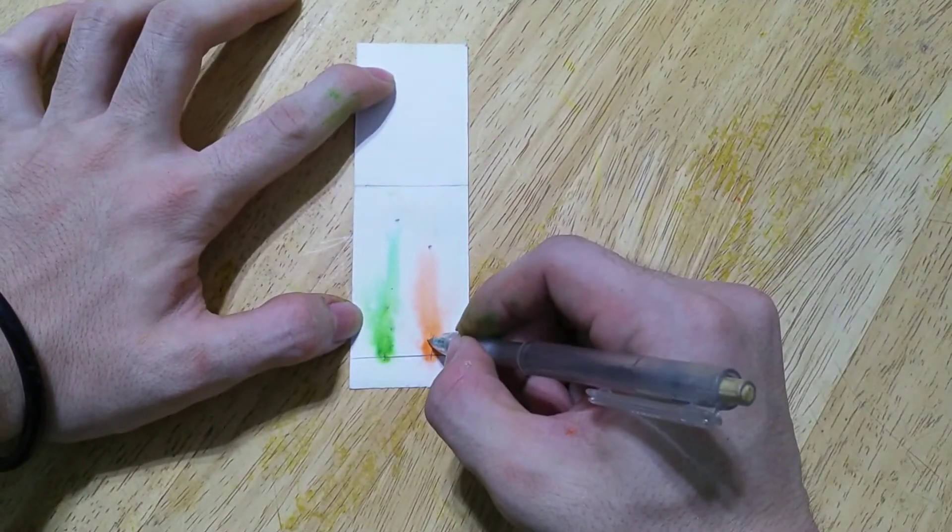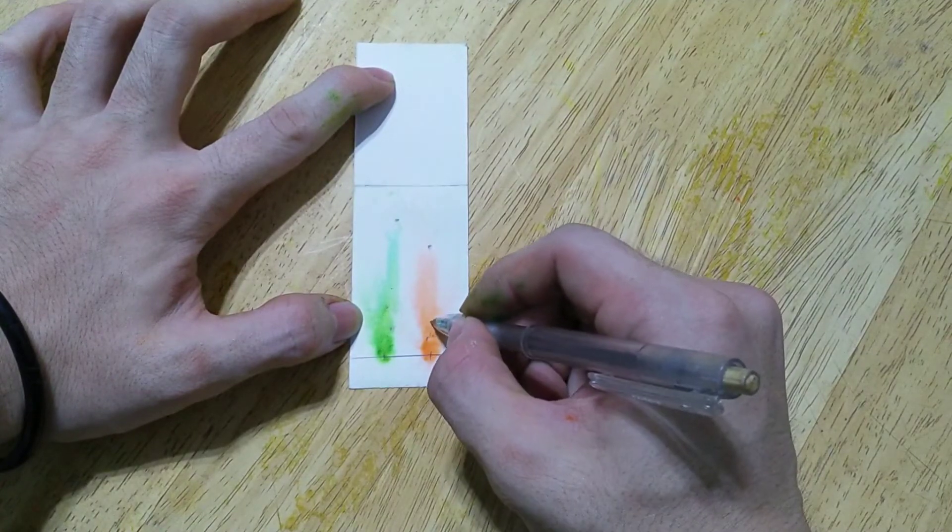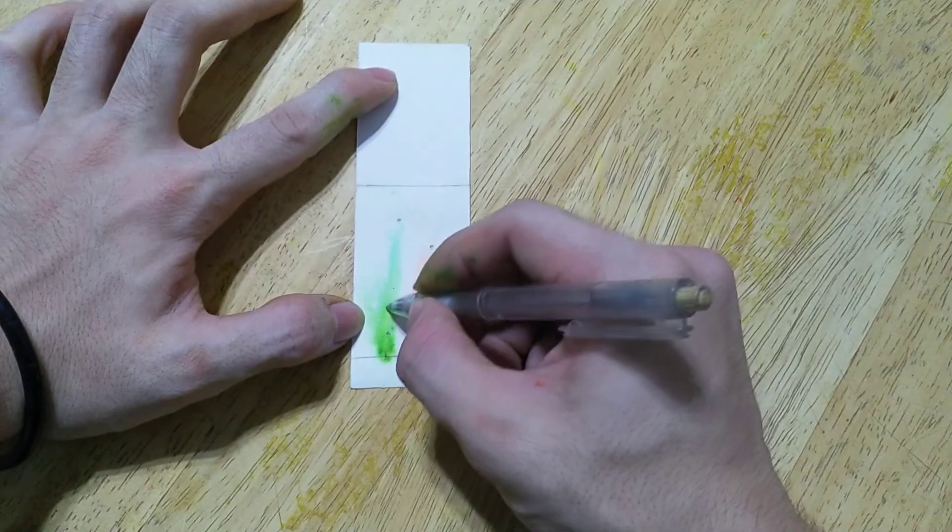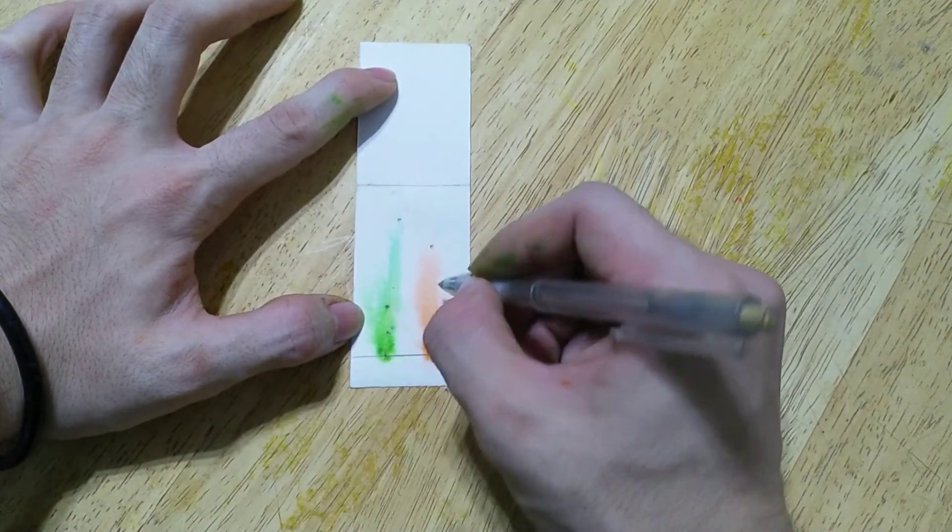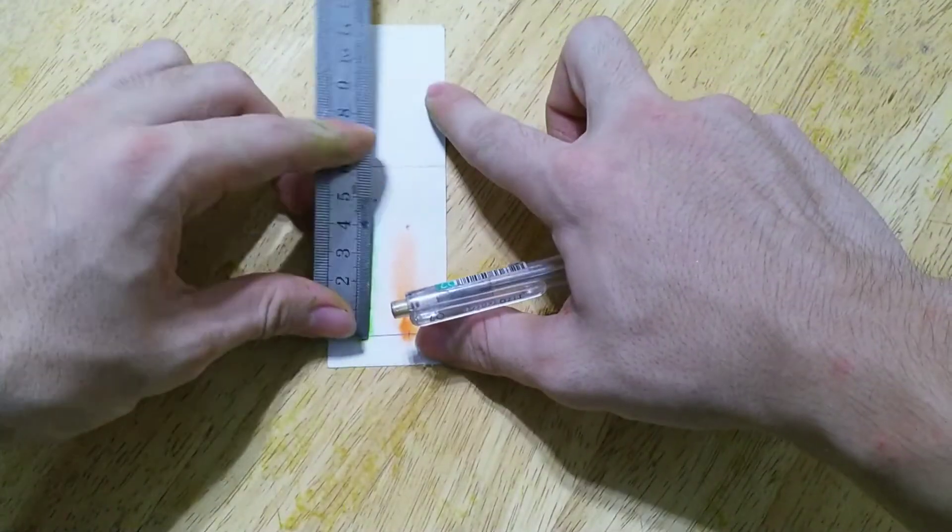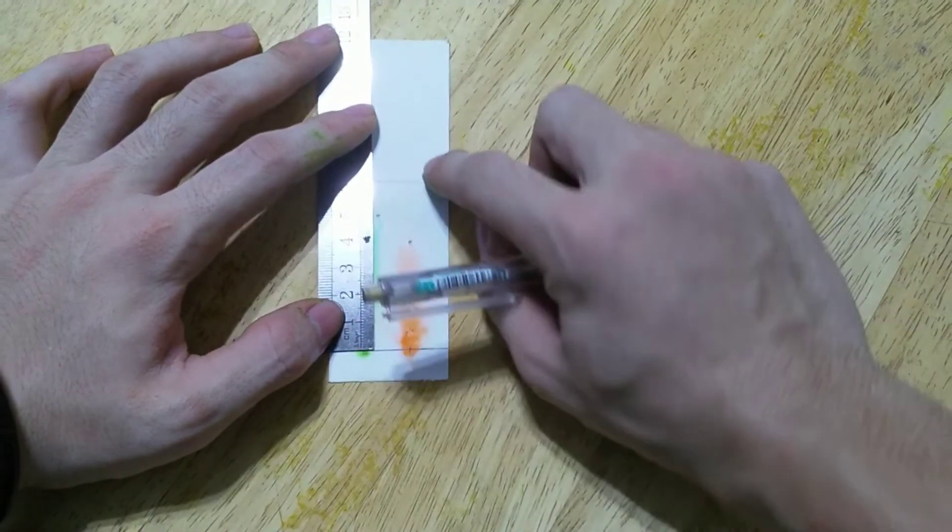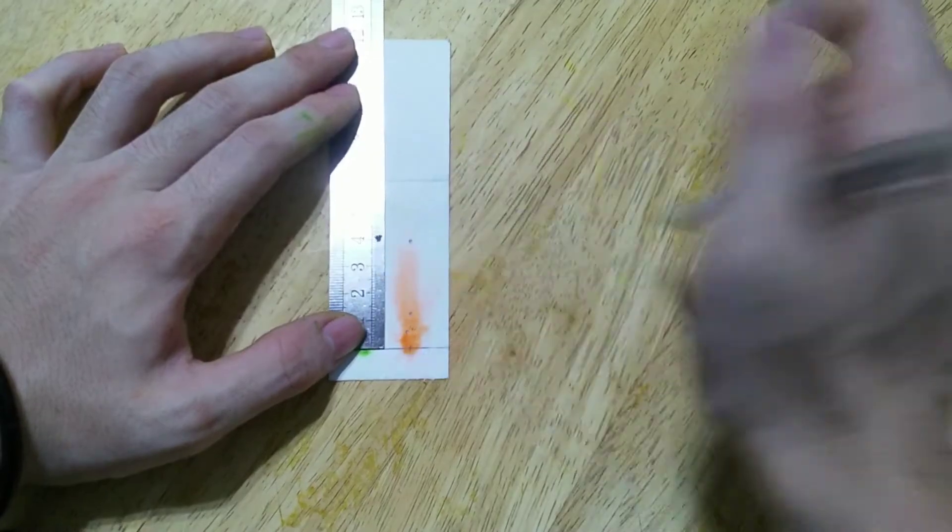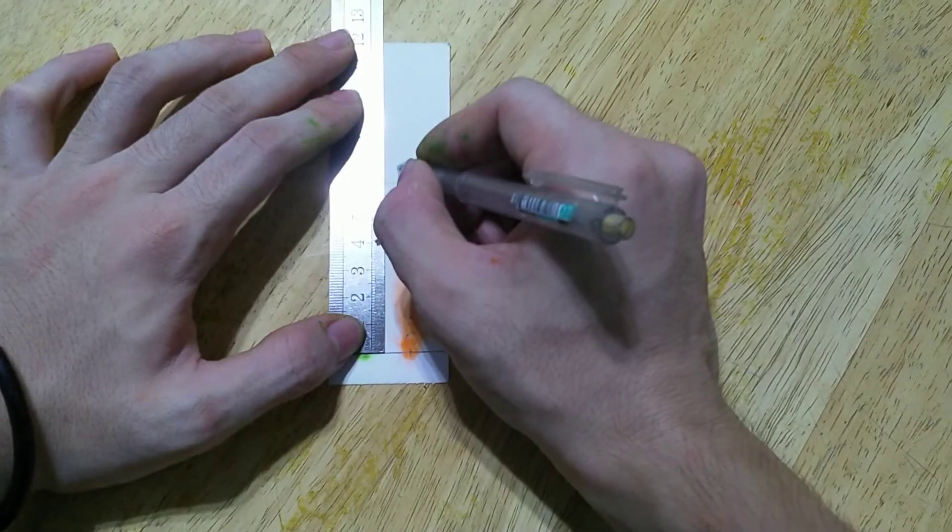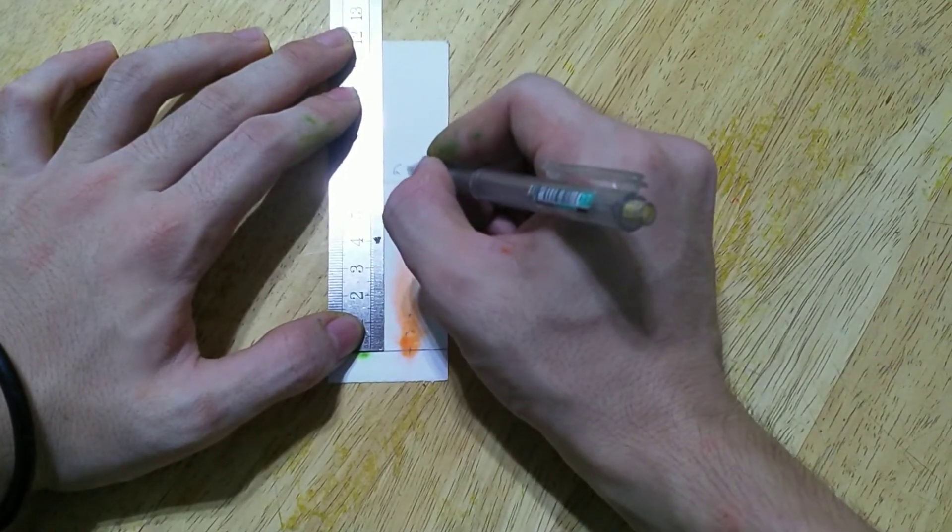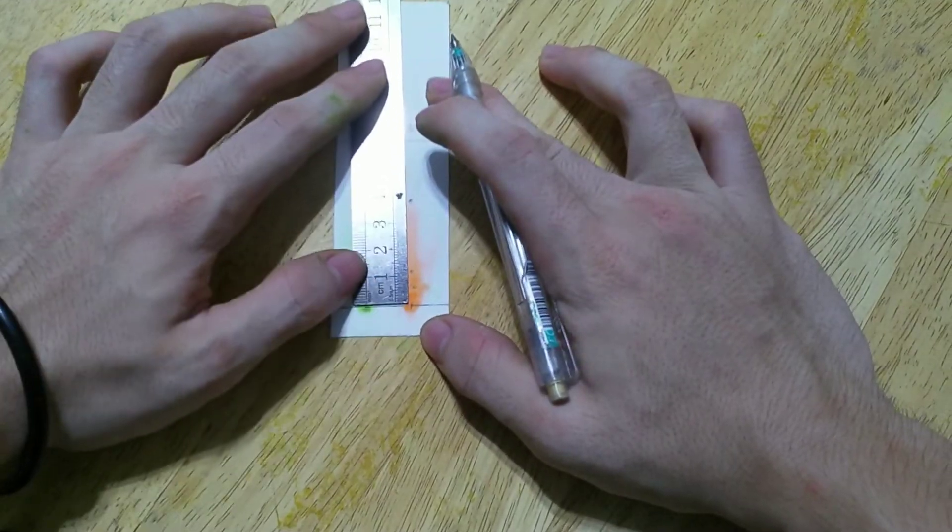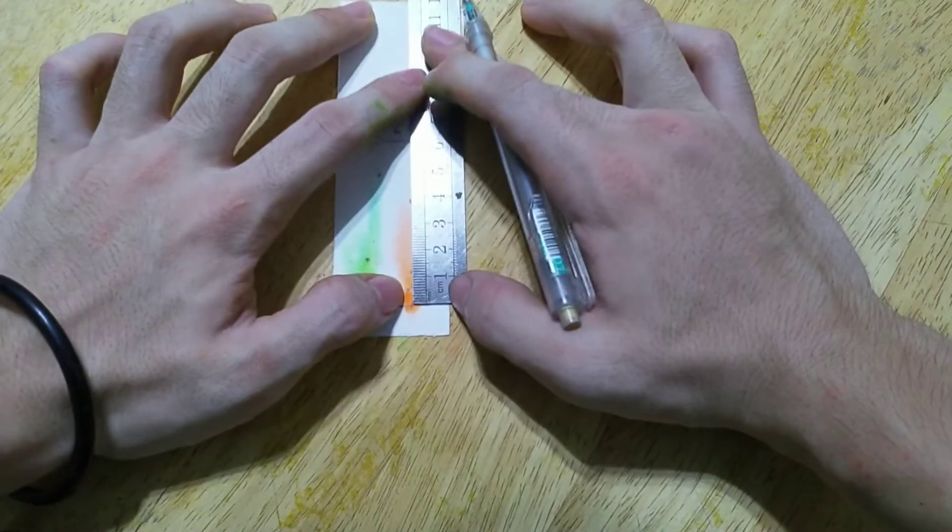So yeah you got one and then one here, here, here. So now take the ruler and measure the distance traveled from origin. So the distance traveled from the origin is 6.3cm and the first spot here is 0.5cm.